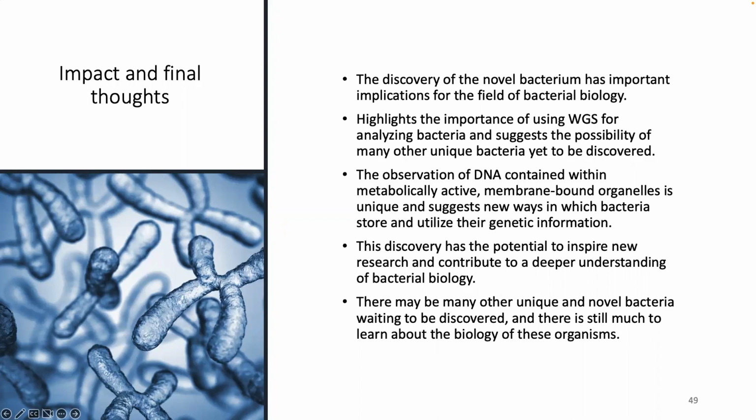And so this is a very interesting study and an interesting application of whole genome sequencing because it kind of highlights exactly what it's for. We have an interesting organism that has membrane-bound organelles. It has this odd dimorphic life cycle that's not common, and it's huge, right? There's got to be something interesting there. And so for something like this, where we blur the lines between prokarya and eukarya, it's worth taking a look, and whole genome sequencing provides that objective look into the genome.